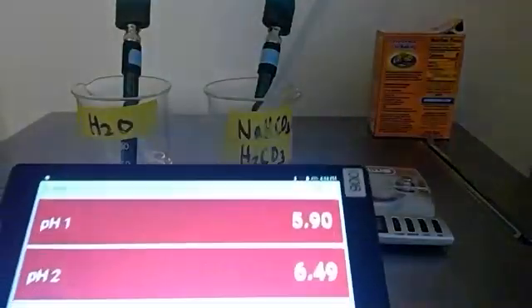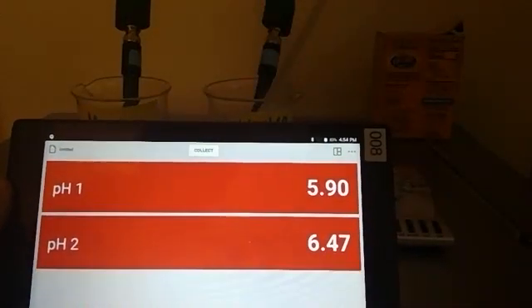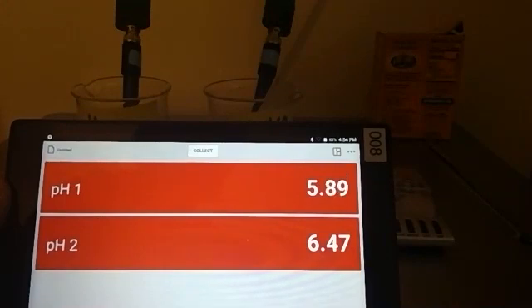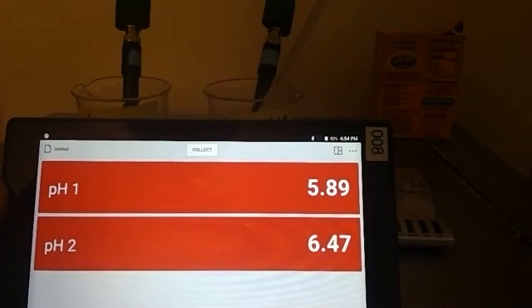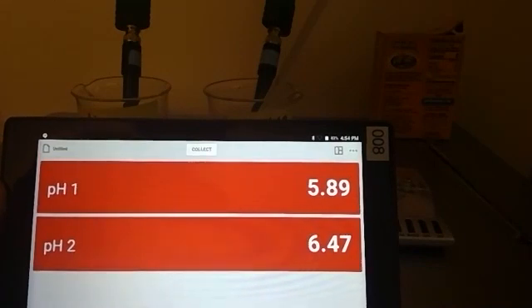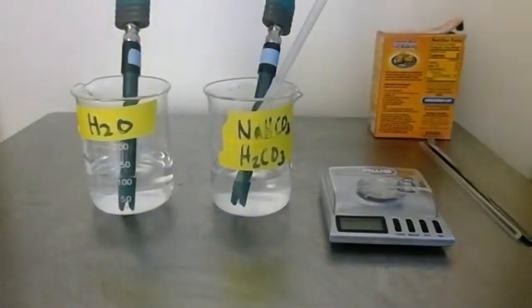I've now blown carbon dioxide through a straw for two minutes and I've brought the pH of my water down below six. Now the water that'll be my buffer eventually has carbonic acid in it and has a pH of 5.89, while my water that has had nothing done to it is still at about 6.47, 6.5.